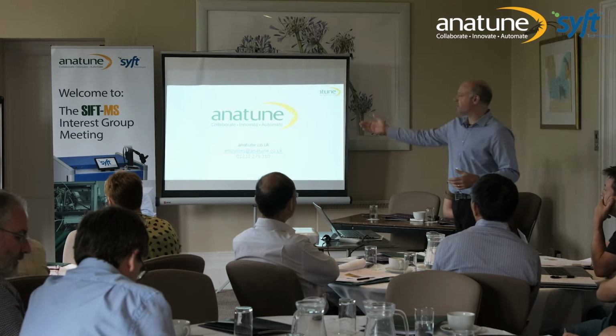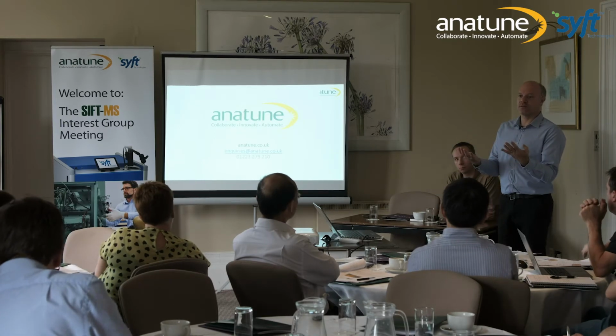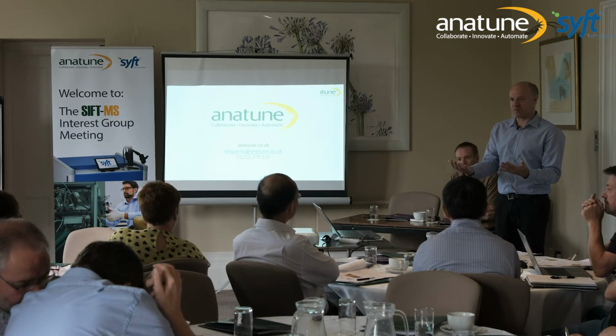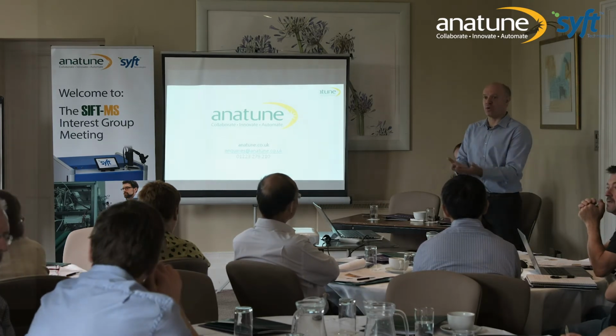It may not have to be a complete validation exercise. It may be enough to run a side-by-side: run the ISO standard as defined, so it might be a GC-MS method, and alongside it run your SIFT-MS method and show that the results compare. That might be enough to validate the use of a new methodology on an older ISO standard.